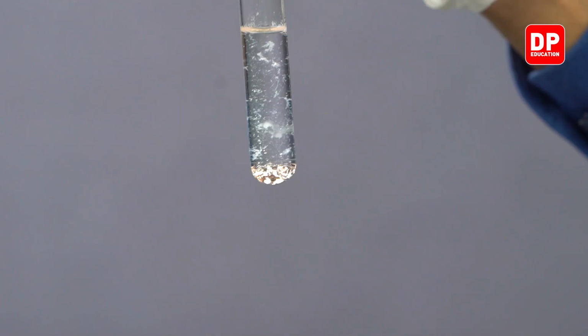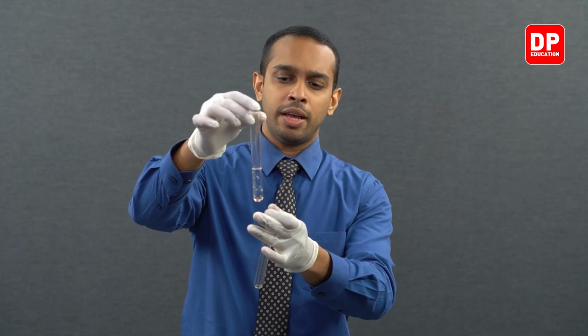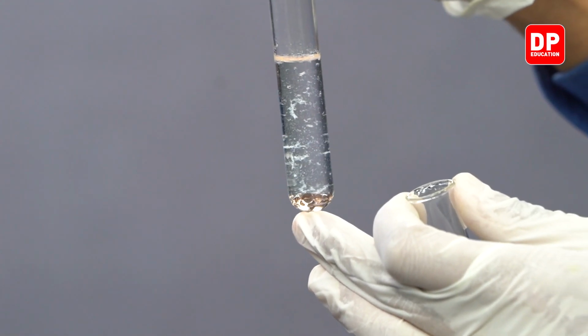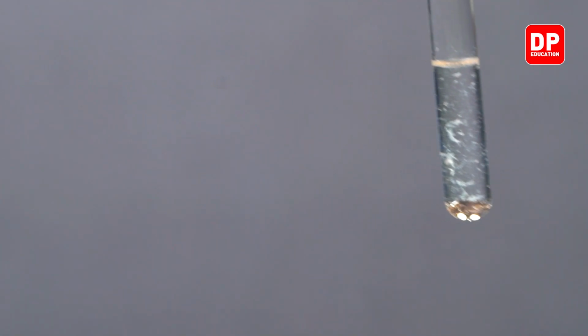You can see even addition of that portion of bromine water did not change the color of the mixture over here. It remained colorless, and at the bottom what you can see is the portion of phenol that is insoluble in water. And in this section of the test tube, you can see the bromine water that was present completely decolorized and formed a white color precipitate which is insoluble in water due to reaction with bromine and phenol.